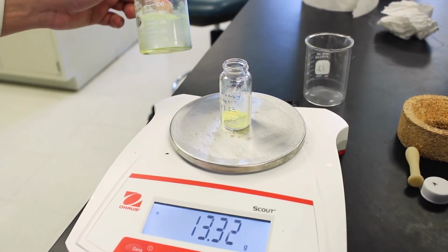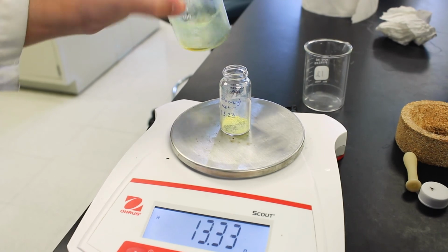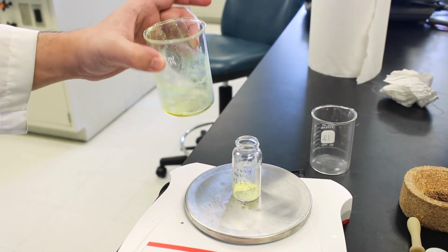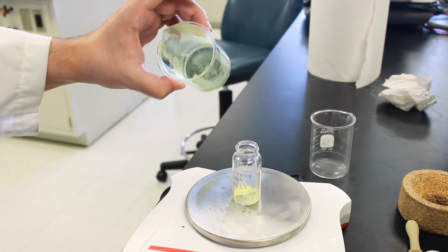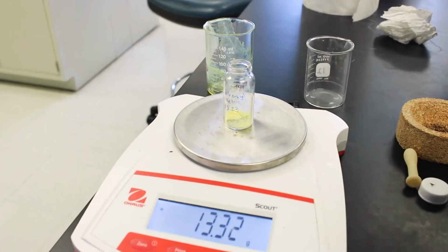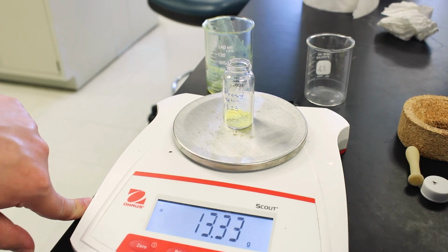So when I washed it out to try to wash out the crystals with cold ethanol, the cold ethanol actually dissolved it quite a bit, and you can see the residue on here after the ethanol evaporates from the walls of the beaker and leaves a residue. So there were substantial losses, even from using cold ethanol, which is supposed to dissolve as little as possible. So we'll definitely need to revisit the crystallization step of this experiment sometime later. Anyway, you can use that value to calculate your yields, 0.1 grams. It'll be low, but you can do it nonetheless.